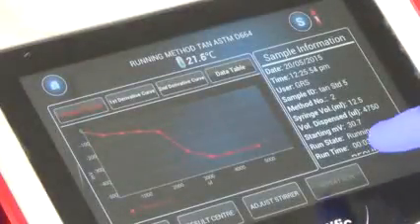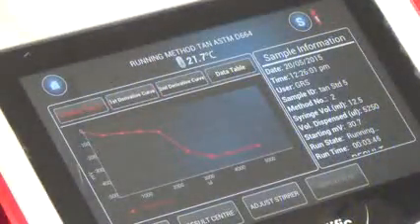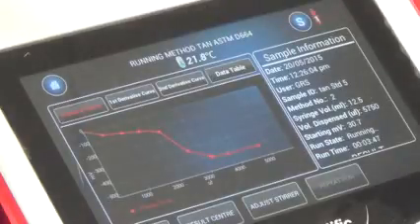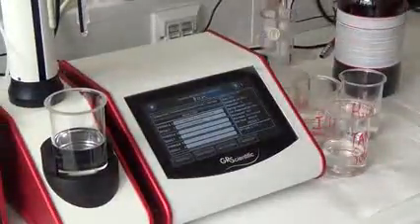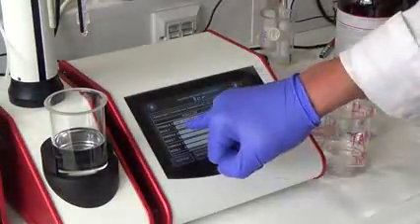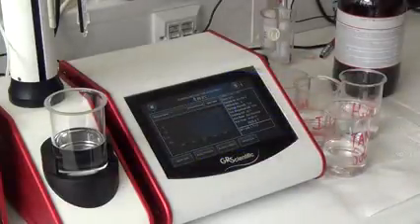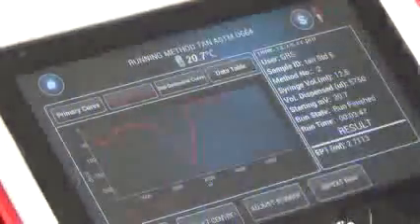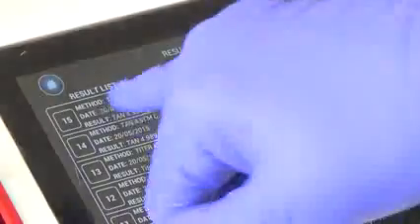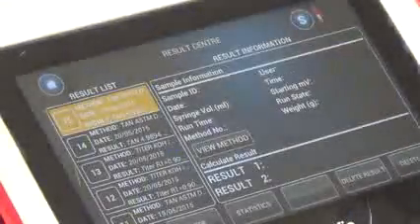So as you can see at the moment, we've got our lovely S-curve here, and the run time for this standard is between four and five minutes, so it makes quite fast. There we go. We have our result. First derivative curve. And there you go. Straight away, the result is stored here in the system.